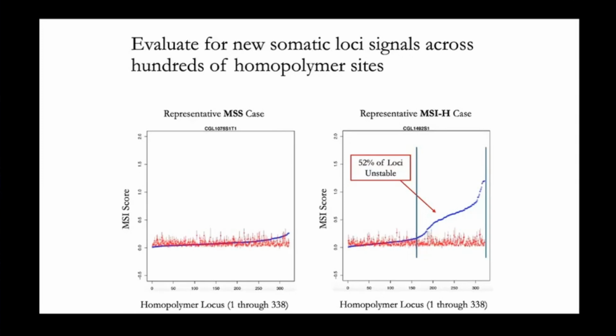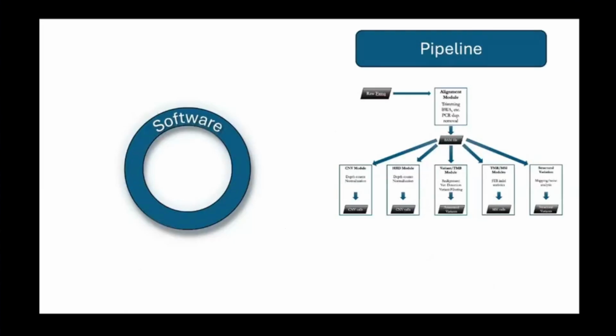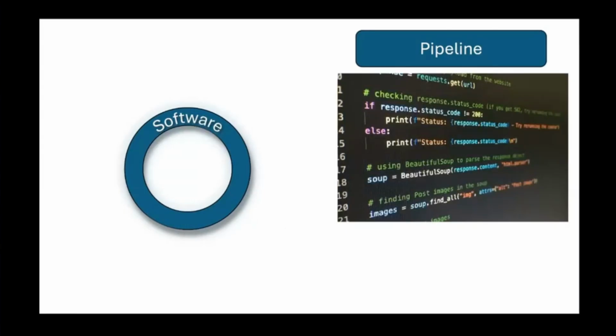And you can see overall that this activity is somewhat similar to variant calling in that we're looking at length affecting variants, but here we're purely looking at length affecting variants, and we're just summarizing them in a different way. So now we have our pipeline, which could really be as simple as a number of commands just typed out in a little file.